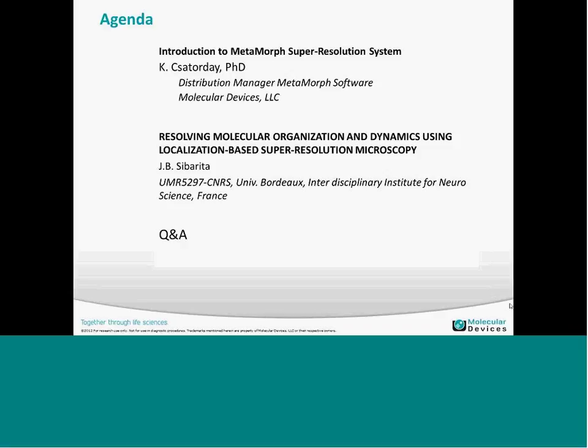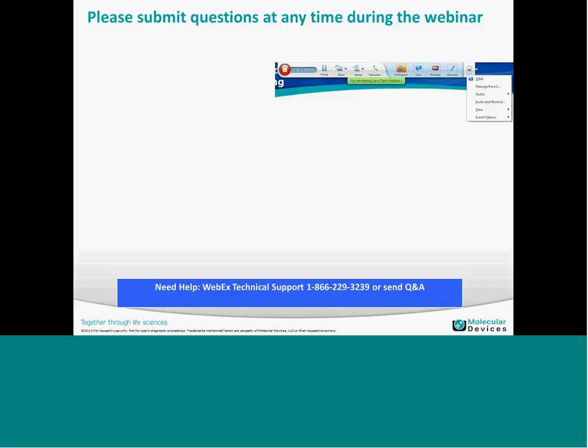The Metamorph Super Resolution System was introduced months ago at the Society for Neuroscience meeting in San Francisco. Today's webinar is reporting on research using such a super resolution system. A few additional remarks are in order. As I said, we are having a meeting with an Atlantic connection with France, and our guest speaker will be talking from his offices in Bordeaux.